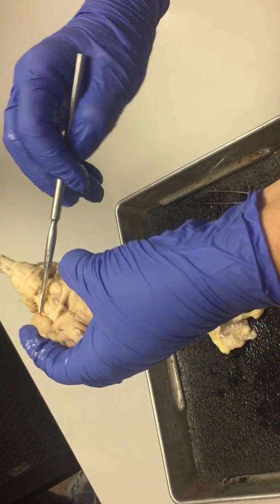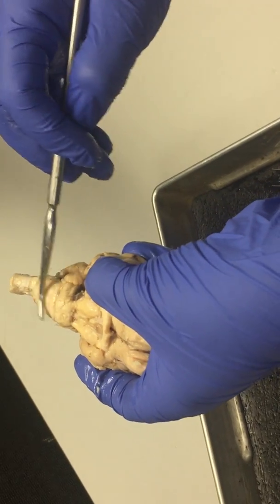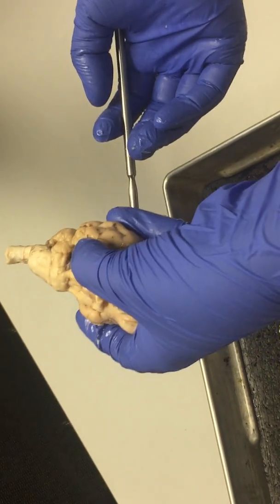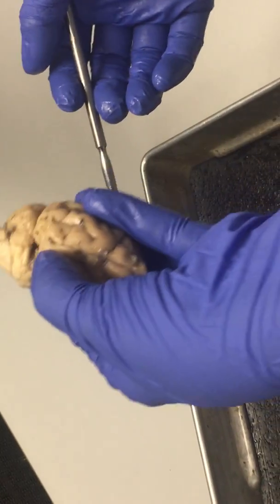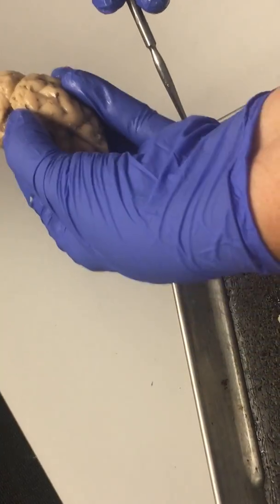Here we have midbrain, pons, and medulla oblongata. It's kind of hard to tell where one stops and the next begins — there's just sort of bulges here. Without more of the spinal cord, it's kind of hard to tell which of this is the medulla. Also, I'm not that familiar with sheep anatomy.